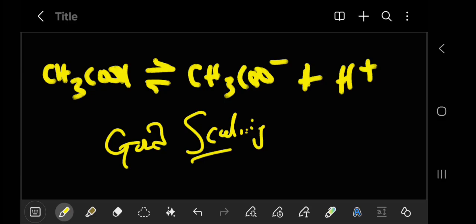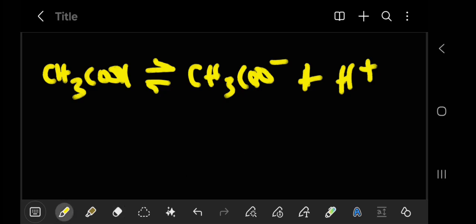You know how to calculate your slope, right? So you do all that, and then you get your pKa, which will give you an insight on the Ka. Then use the relationship between them to derive your final conclusion. Like I said, no one is going to ask you to prove.